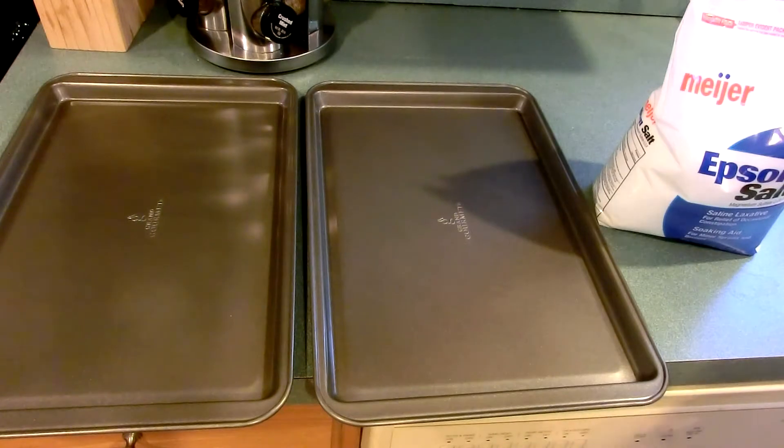Hi everyone, welcome to another Doug's Lab video. In this video, we'll be making anhydrous magnesium sulfate for use as a desiccant in the laboratory.